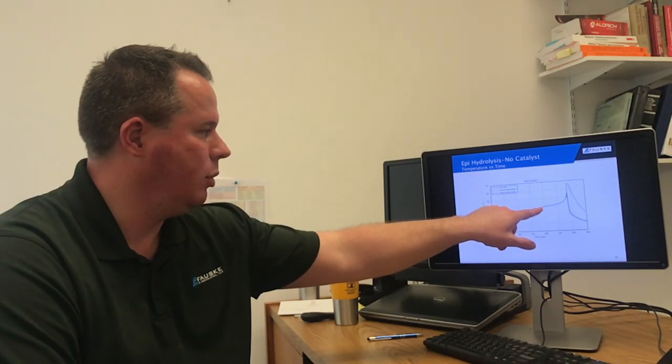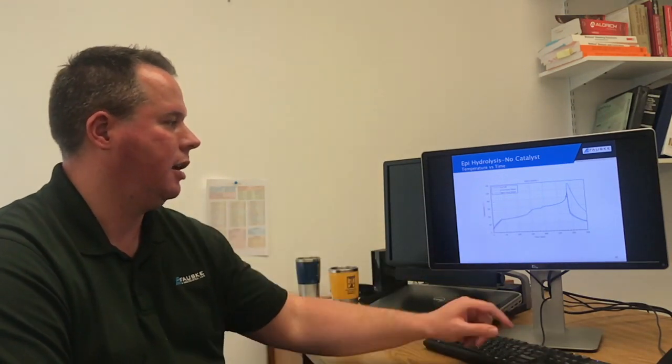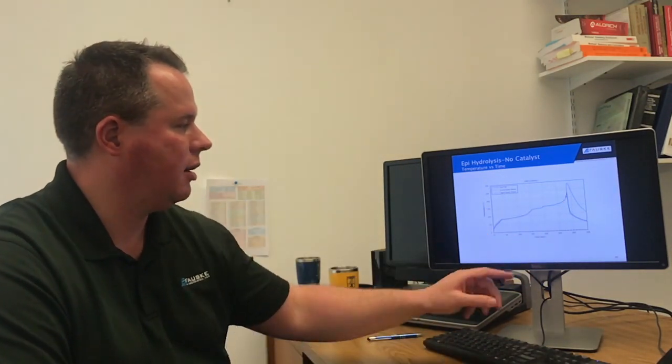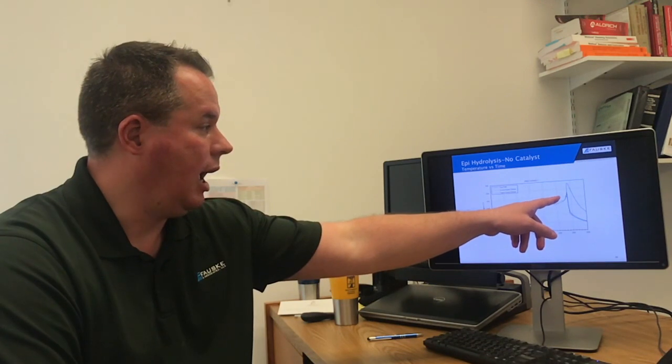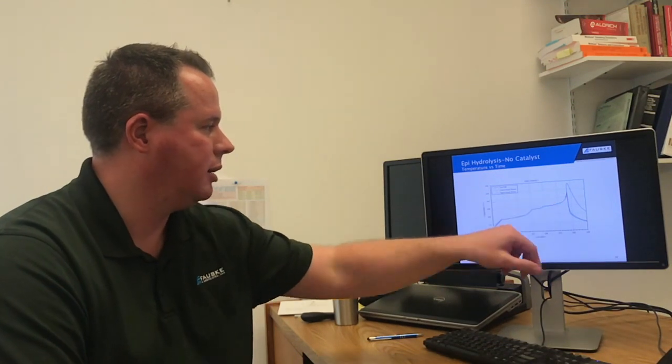Ultimately, when we heated to 150, we did see another reaction occur, and you can see that reaction take off. I actually turned off the heaters to try and end this test when we were only at about 230 degrees Celsius and, I believe, about 500 psi.